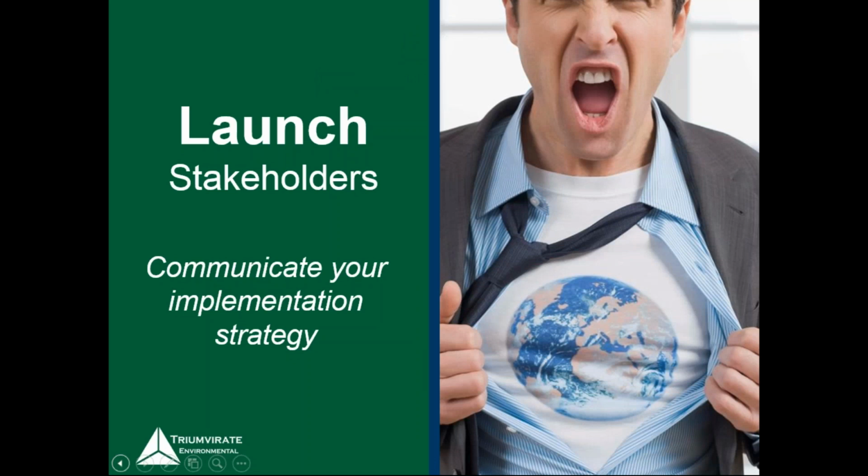So launching, talking about stakeholders and communication, again, I can't overemphasize how important it is to communicate with your stakeholders. Inventories are not a perfect thing, so meeting with your stakeholders regularly and keeping them informed of policy and procedure changes is pretty important.